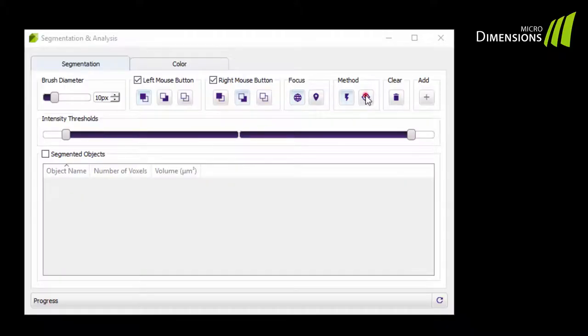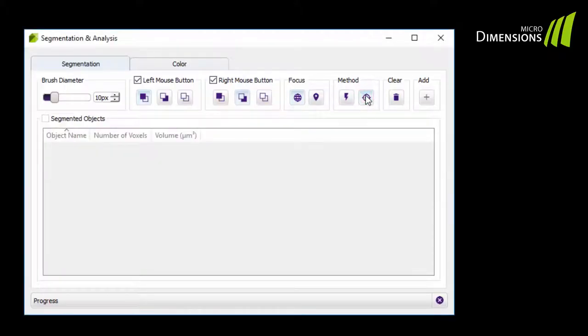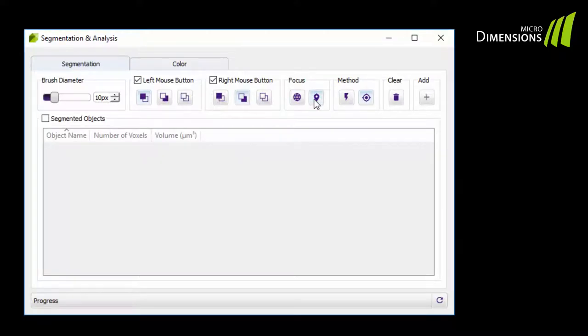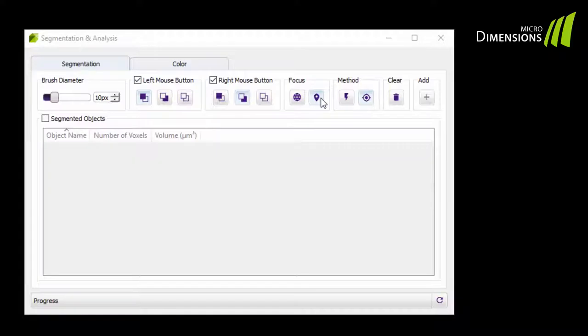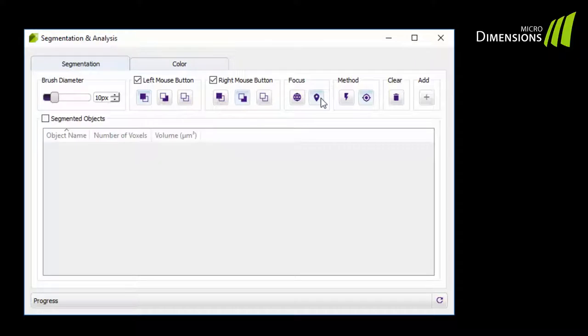First, I choose the Accurate segmentation method. Then as Focus, I will select the option Local to limit the algorithm to a certain region. As I have selected the Accurate method, I need to define the object, so-called foreground, and background pixels.